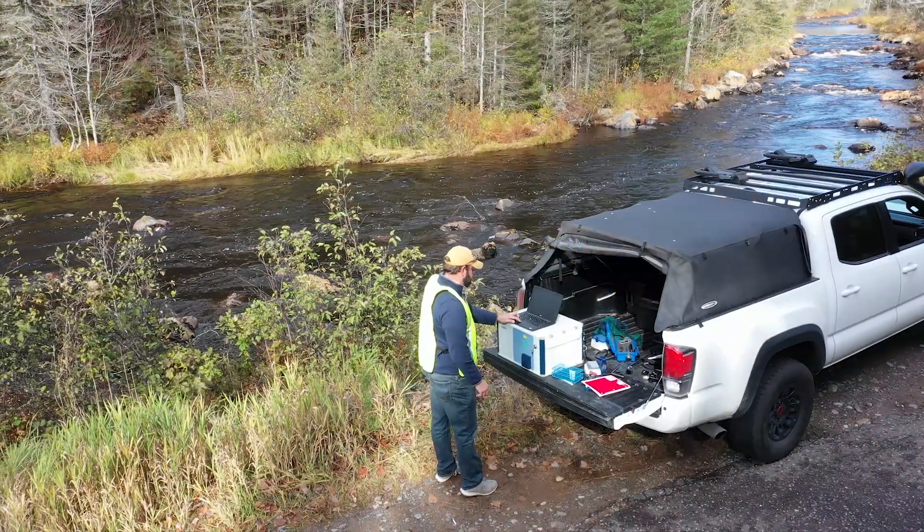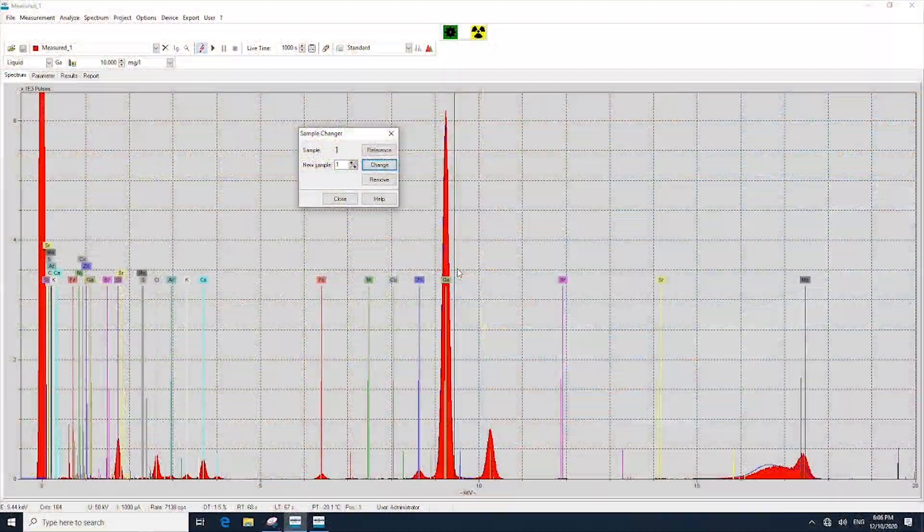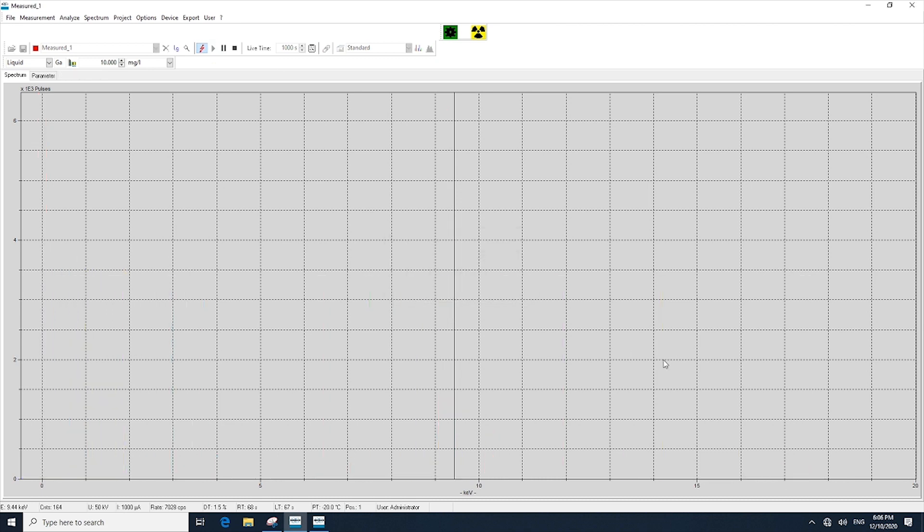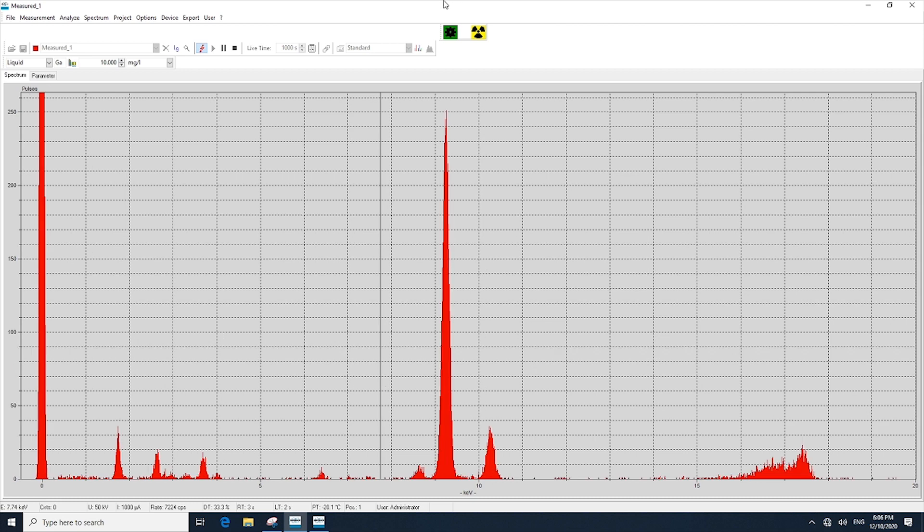Here we see the software interface from the Bruker S2 PicoFox. Since we're just running one sample, we loaded it into the first position and started our analysis. Immediately you will start to see the different elements present in the sample begin to appear as individual peaks.